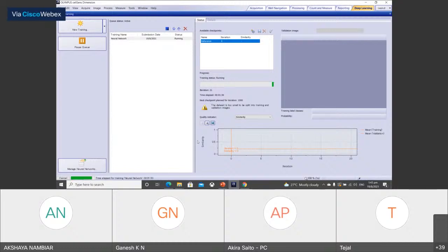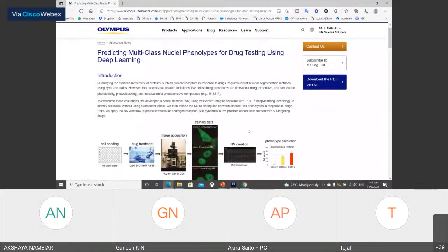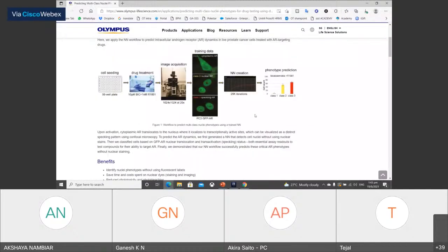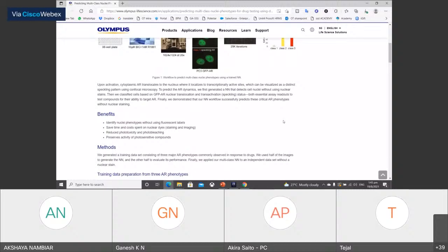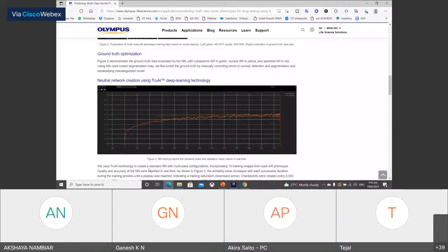I'm very sorry that I cannot show this one, but for example, I will show you how it looks like. By the way, this is the application note which I showed in my presentation. I think you can find some details on this site. During the neural network creation, you can find this is the similarity, and this is how many iterations we did to create the neural network.